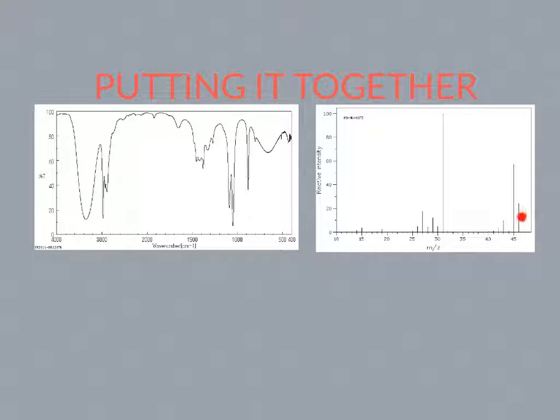We'll go one to the left, to 46, where we have a peak that we can actually use. So M+ will be 46. Then we'll go find our base peak, and that is definitely looking like it will be 31 here. Keep that down. That's our largest peak, coming almost all the way up to 100 in our relative intensity.